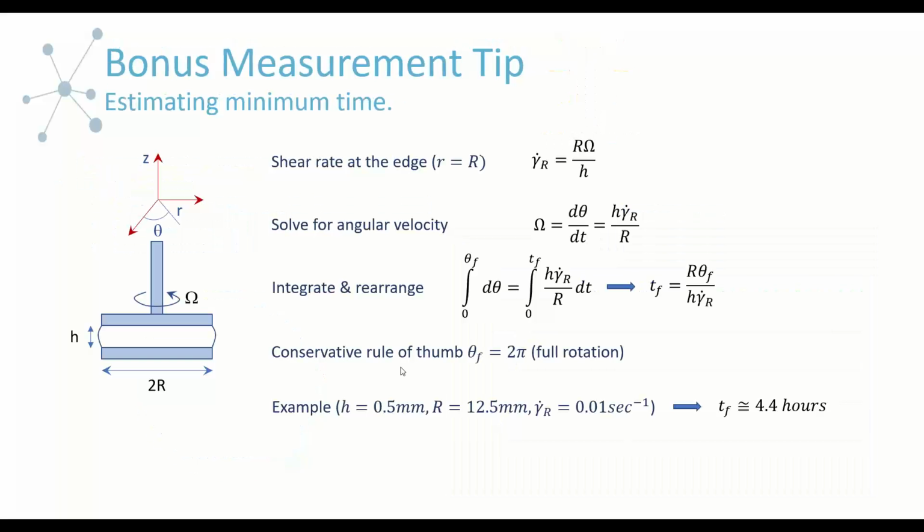And so my apologies again for the equations, but this is a way where you can calculate, based on the information that you have regarding your tools and the particular rate that you want to operate, how long you need to run your experiment. So we're going to look at, again, our parallel plate geometry and what's going to be important.